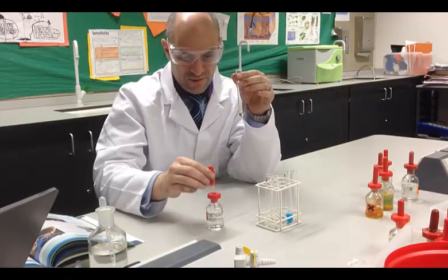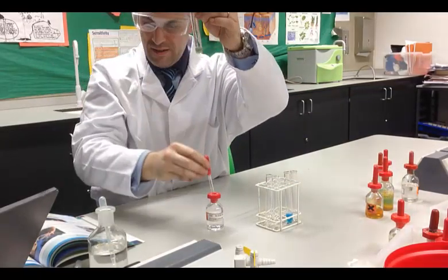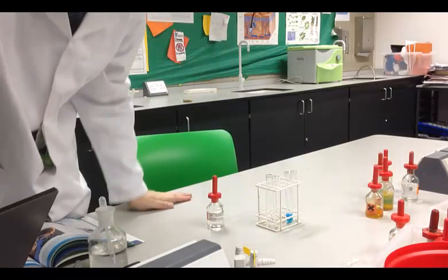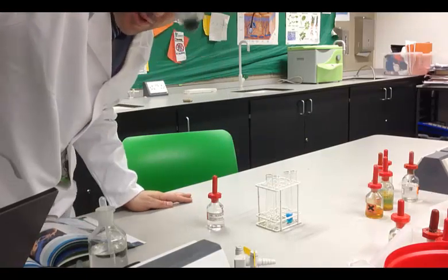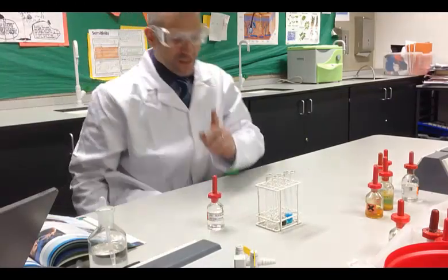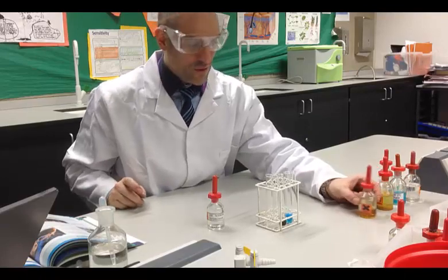I'm going to add some test reagent, and you get this green precipitate. Another green gelatinous jelly or snot-like precipitate. Please say gelatinous in your exam, don't say snot. Okay, that was iron 2. So iron 2 gives you a green precipitate.